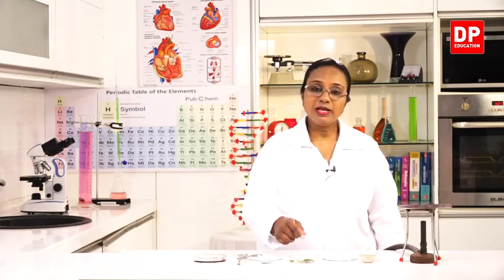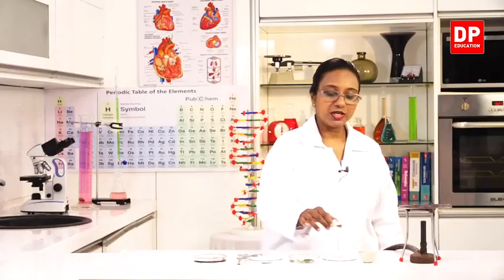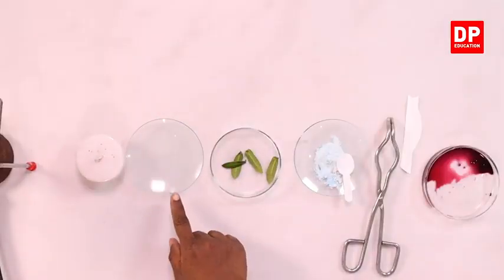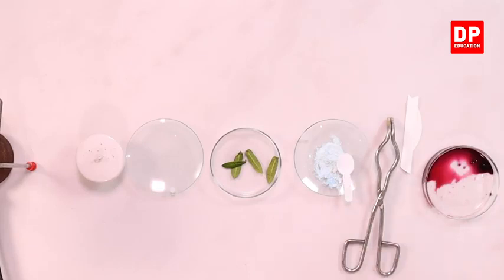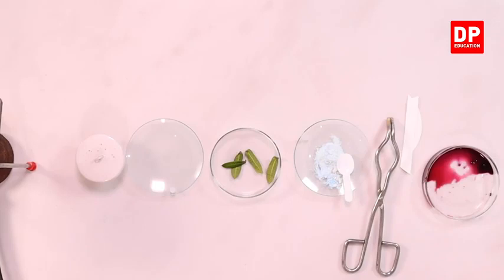And then, we will have to heat this for a long time. So, I am going to use a crucible with a lid, a watch glass to make the vapor condense on it, and anhydrous copper sulfate, which has to be white in color.